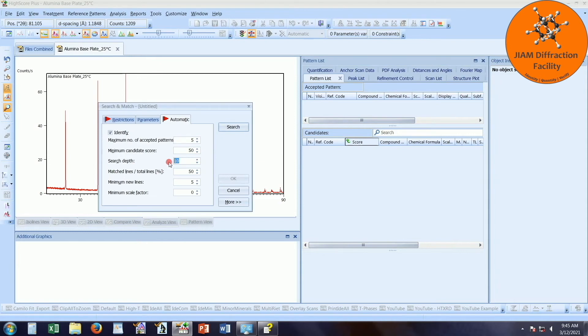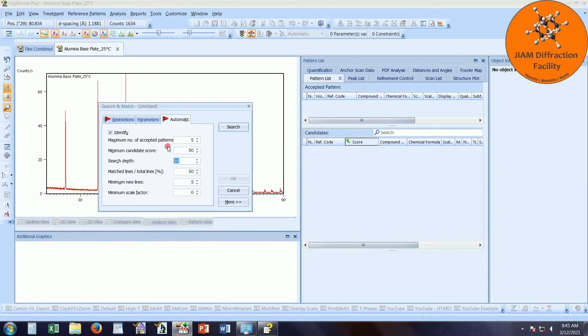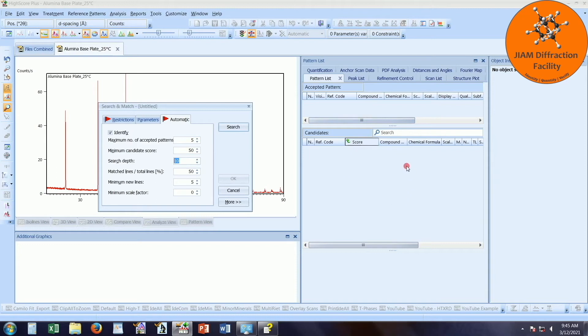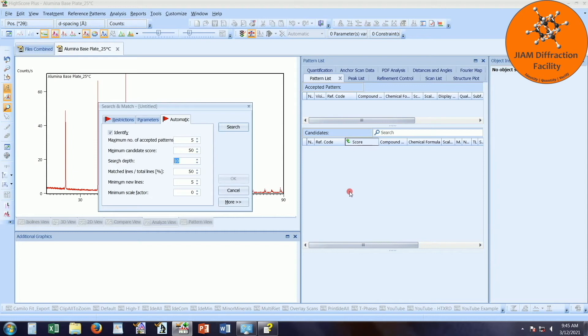Search depth, I have 10. So what that means is that once we get our candidate list, HighScore Plus will search the top 10 candidates to see if any match these parameters. If so, it will take the highest scoring candidate and move it into the accepted pattern list. At that point, it will reorganize your candidate list based off of what peaks remain unidentified. And it will do the same thing again. It will search the top 10 candidates to see if any of them match our automatic identification parameters.